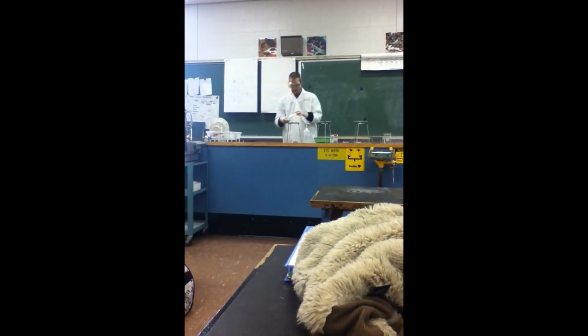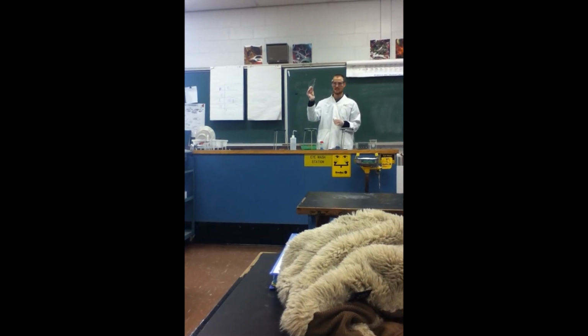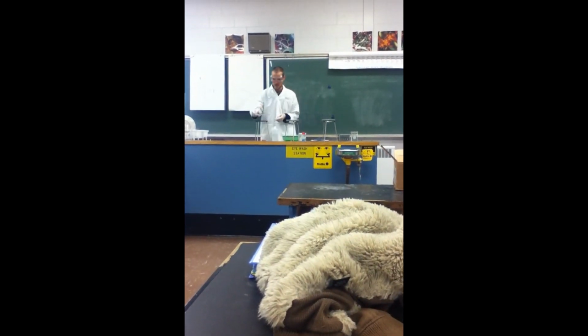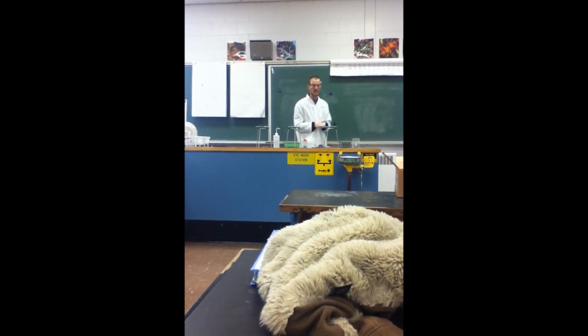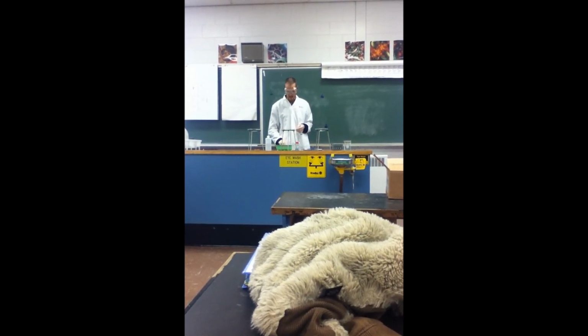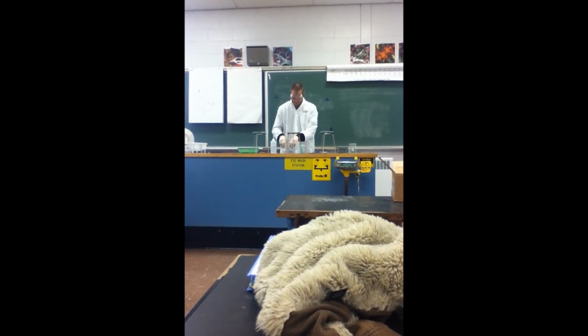From there, you take this piece of glass. Does anyone know what this is called? A glass. A glass. Okay, a watch glass. Okay, it's called a watch glass because you can watch reactions going on inside of this glass. Okay, so I have 3 of them set up here because we have multiple types of colors for the flames that we are going to be making.